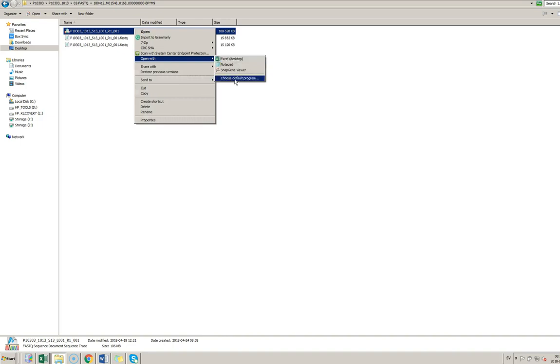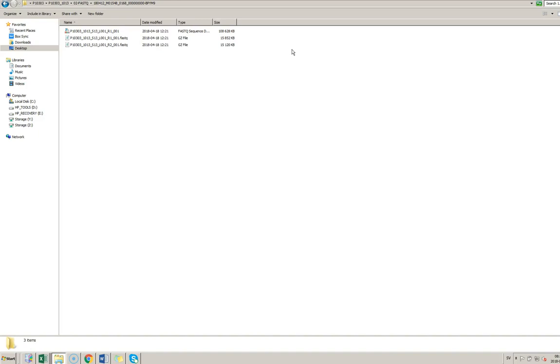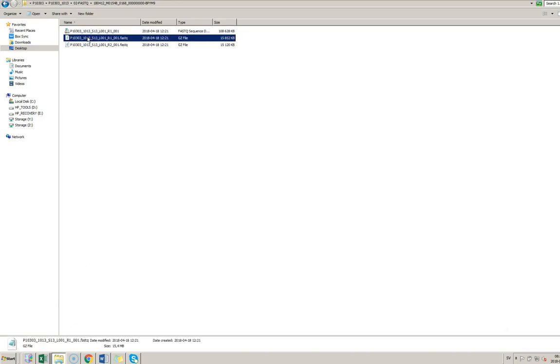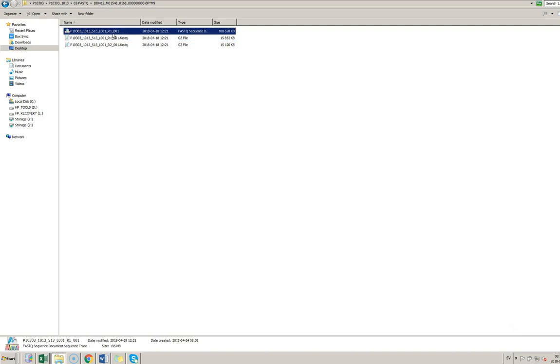You need to find Excel and try to open the file. This is not optimal because the file is too big for Excel — it's only going to be able to open about half of it — so we're losing a lot of information. Excel is not, as mentioned, the best way to analyze this type of data, but anyway, this is just a way to get a feeling for the sequences.